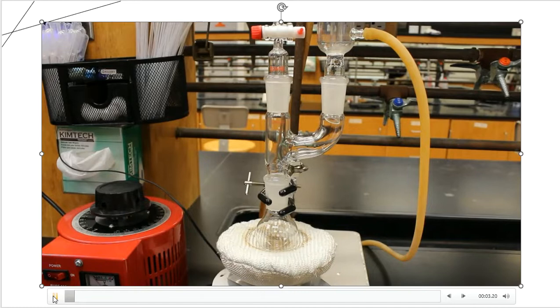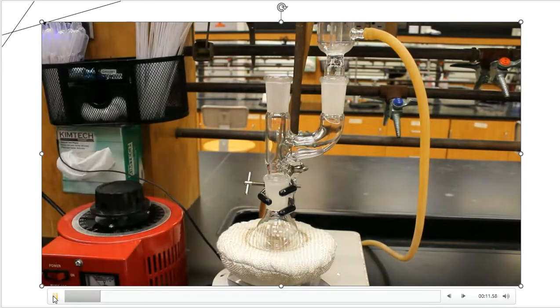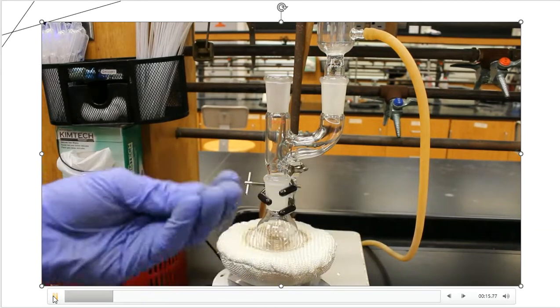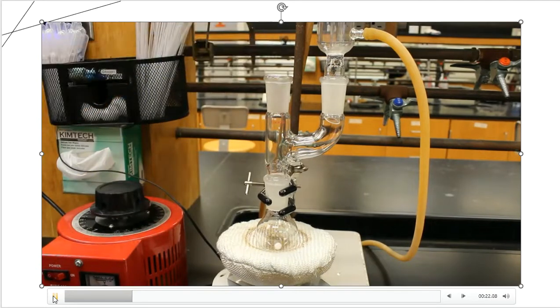All right, so the lab directions tell me to add my methylene chloride and add the anisole into the boiling flask with a very small magnet. I do have a very tiny magnet. It's basically right there. You can see it. It's like a little nugget, a little nugget of joy right here. All right, so I'm going to drop the magnet on the inside of the boiling flask. It's down in there. It's going to help me stir it.